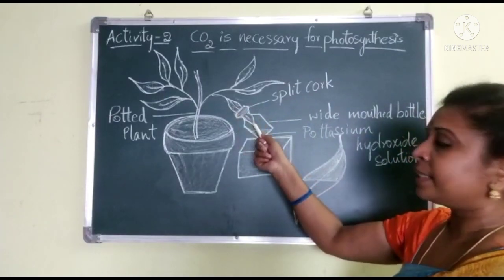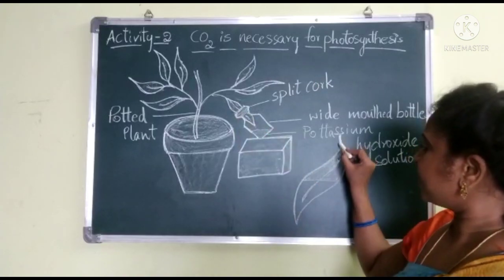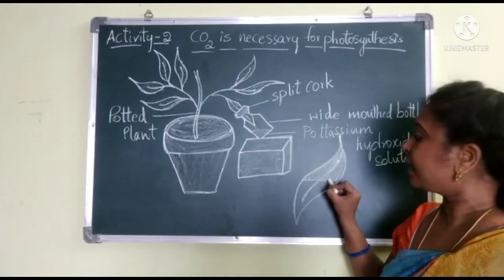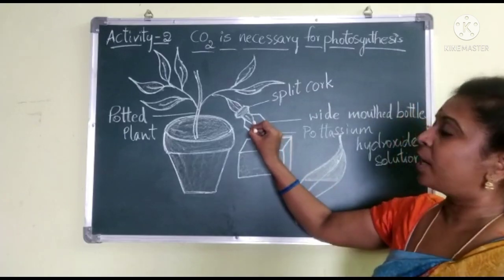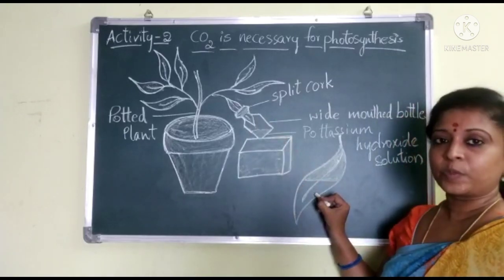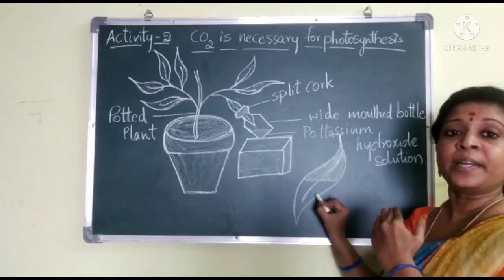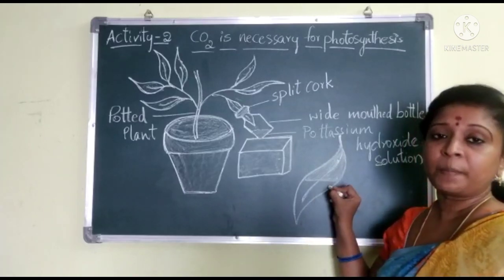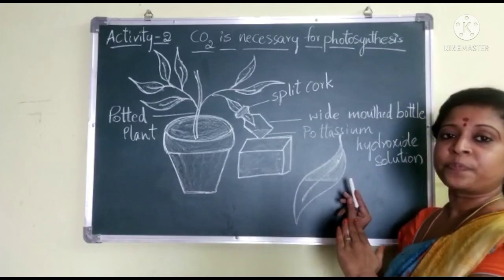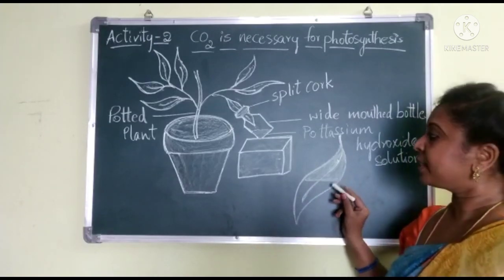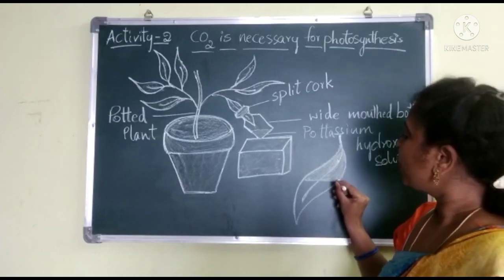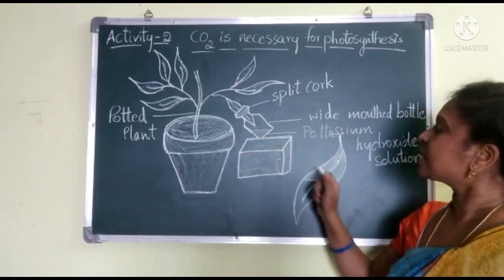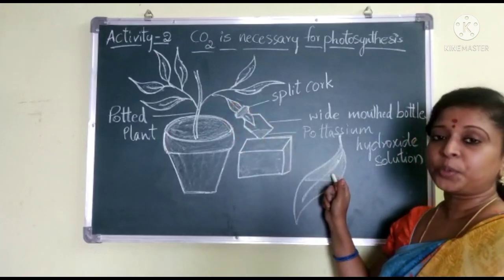Take the leaf which was inserted in the bottle and test it with iodine solution. We boil this leaf in methylated spirit to perform the starch test — by boiling in methylated spirit, the chlorophyll content is removed and the leaf turns pale. Now when iodine solution is applied, the portion that was inside the bottle will remain pale in color, while the portion outside the bottle will turn blue-black.